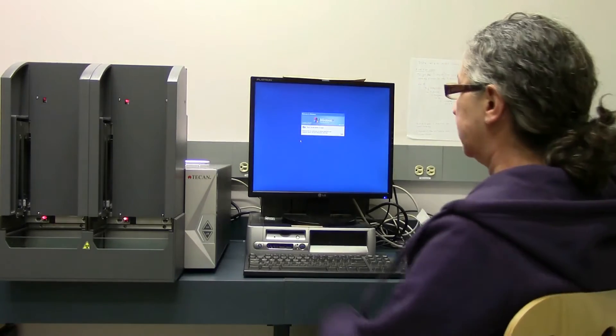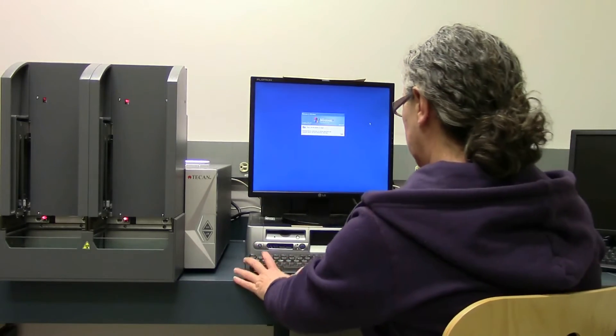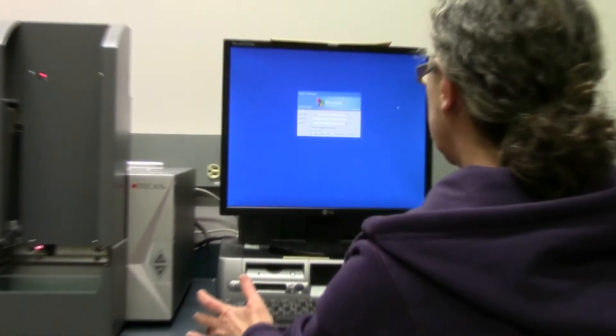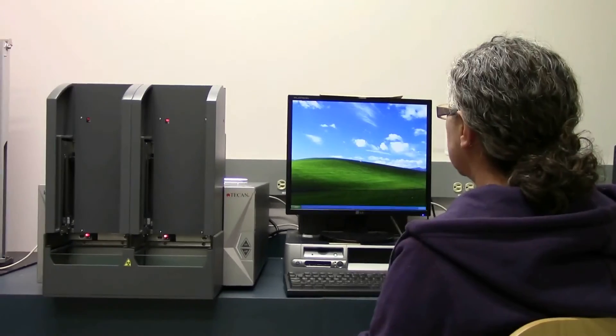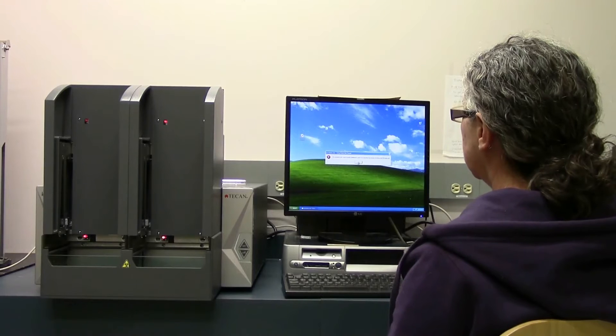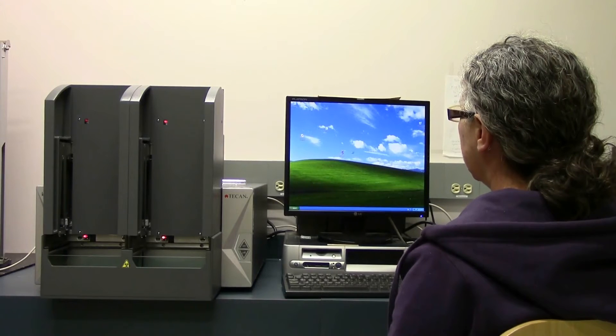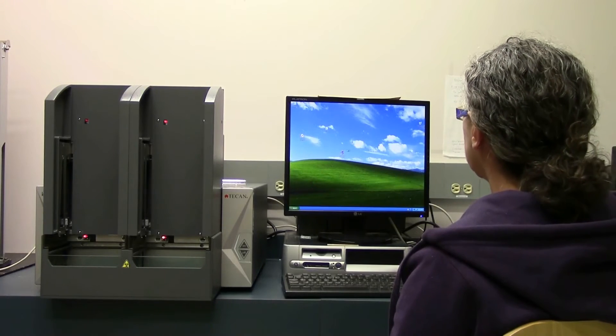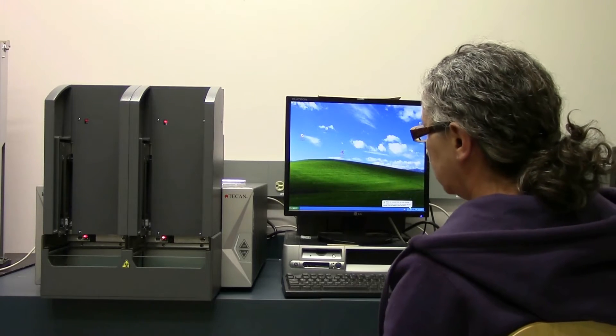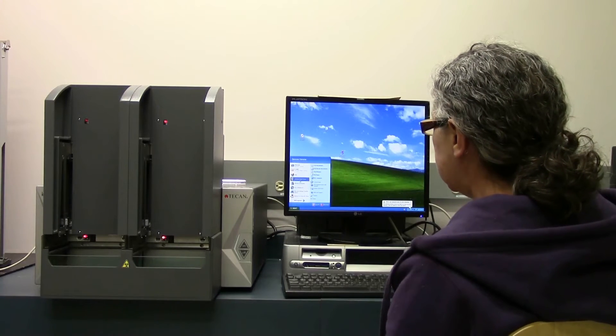And then to access the software, you log in with your Mac ID. The first thing you need to do is get this iControl icon onto your desktop. To do that, you go to the start button.